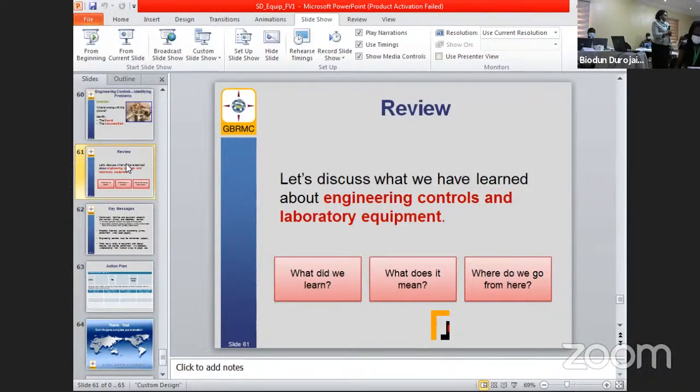Also, ideally, most of those machines should have an odor extractor. So when those odors come, the extractors will pull them out, and the people in the immediate area are safe. But in most of the places we have, those things are bad. So the odor comes out, it goes to the mainland, and everybody runs. So if it's smelly, there is a biological agent. She has answered that question. So I really don't know.